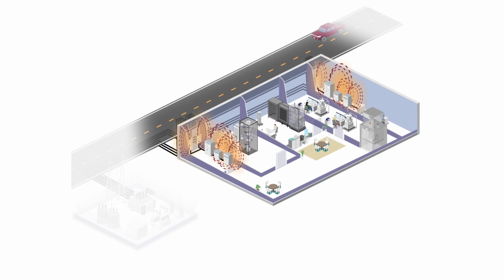However, what's often overlooked is if you have two electrical rooms on either side of the facility, and a feeder or busway going between the two, and that feeder or busway happens to go through the slab or overhead or on the adjacent wall to your electron microscope or e-beam lithography room, these feeders and busways are problematic and often not noticed by customers until you start taking EMI measurements and doing some further investigation. This is something we look at closely. If we do our modeling, we look at the magnetic field generated by the electrical rooms, but also the feeder conduits that feed between the two.